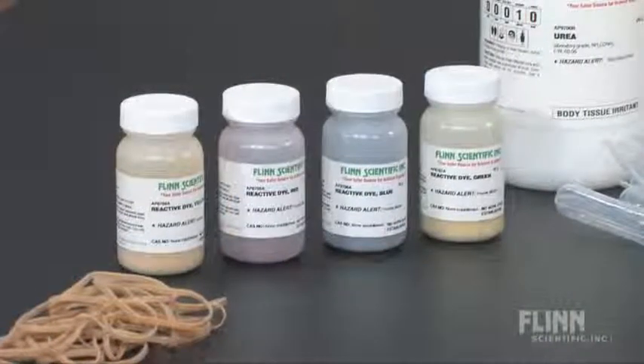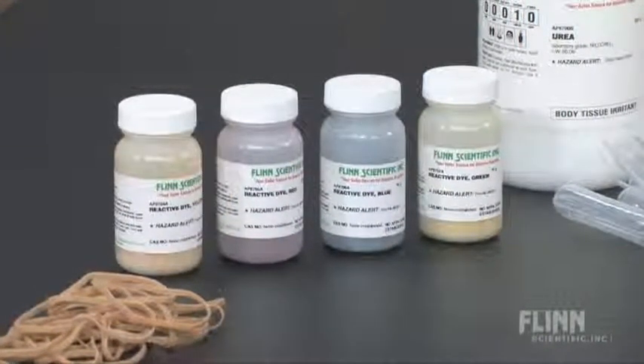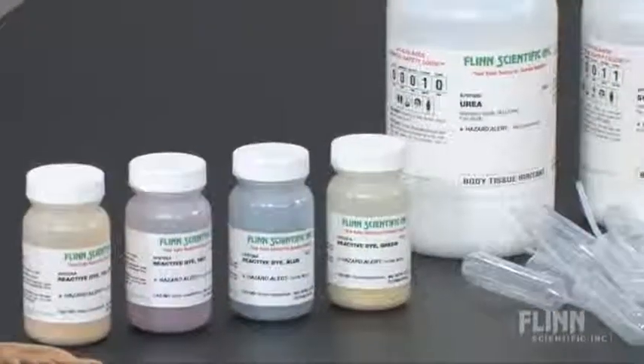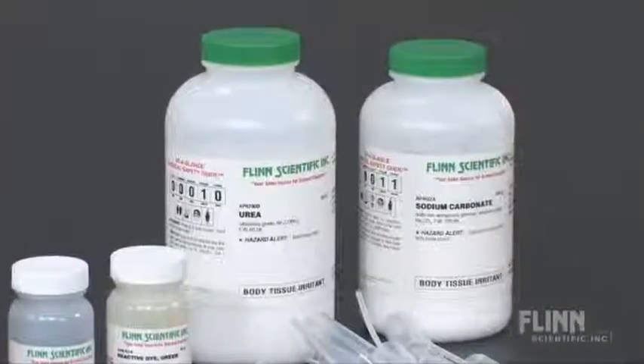The Flynn tie dyeing activity kit contains enough materials for 30 students working individually. Yellow, red, blue, and green dyes are all included, as well as the chemicals necessary to make the dye solutions and prepare the clothing items to bond the dye.